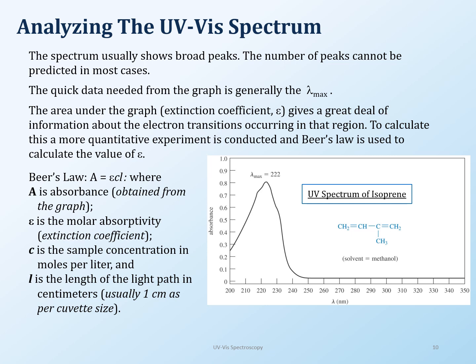Now let's just consider that maybe you had another small peak over here. Let's just say that. What does this tell you? Now, this is also a lambda max, but what this is telling you is that these electron transitions are not that possible or conducive. There aren't that many electron transitions here.